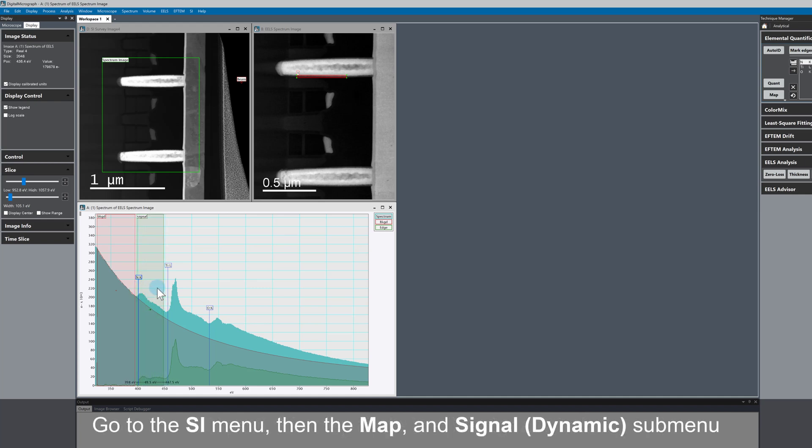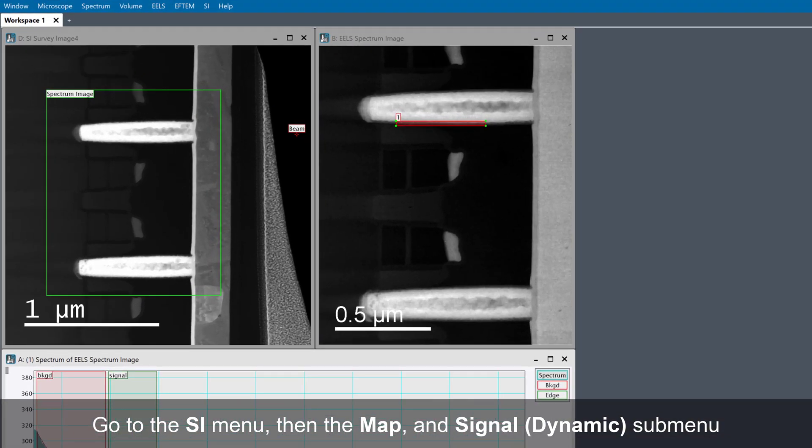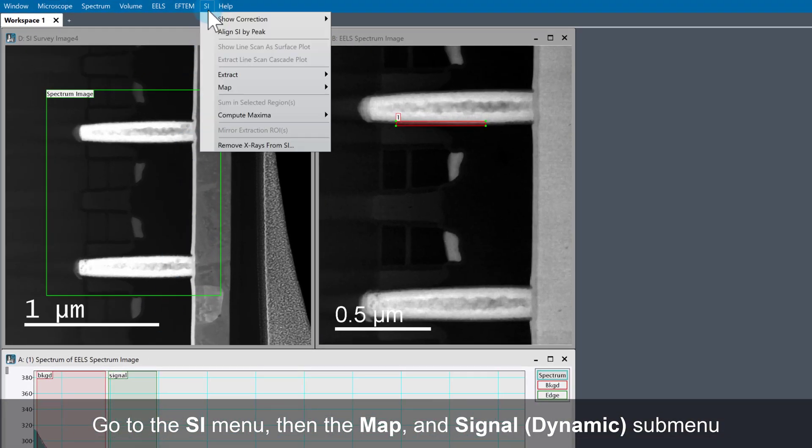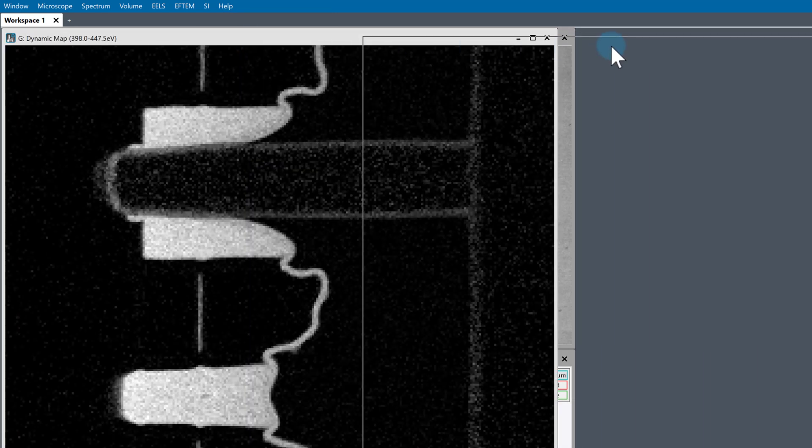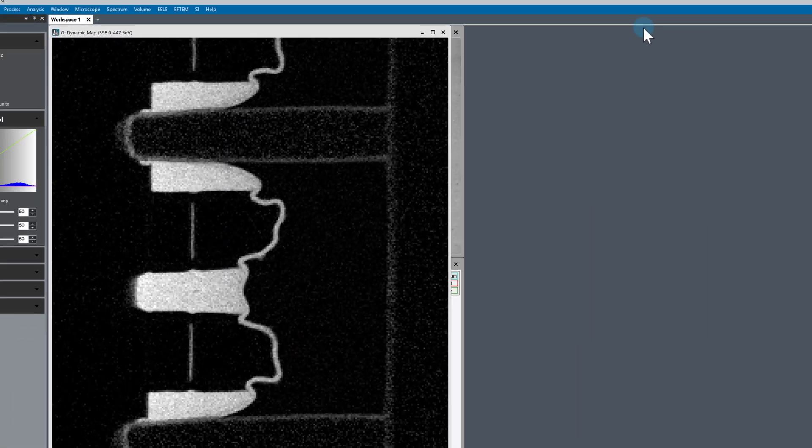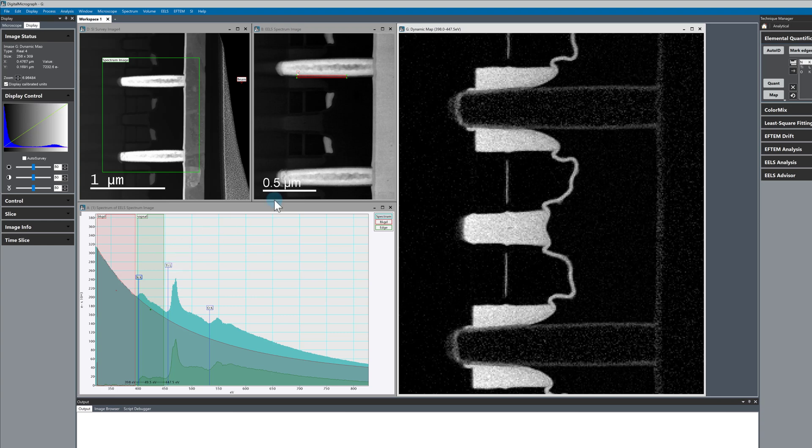Once we've done that, we need to go up to the SI menu, go to the map submenu, and then choose signal dynamic. What we're looking at now for this example is a nitrogen signal map. High brightness is where we have nitrogen rich regions.